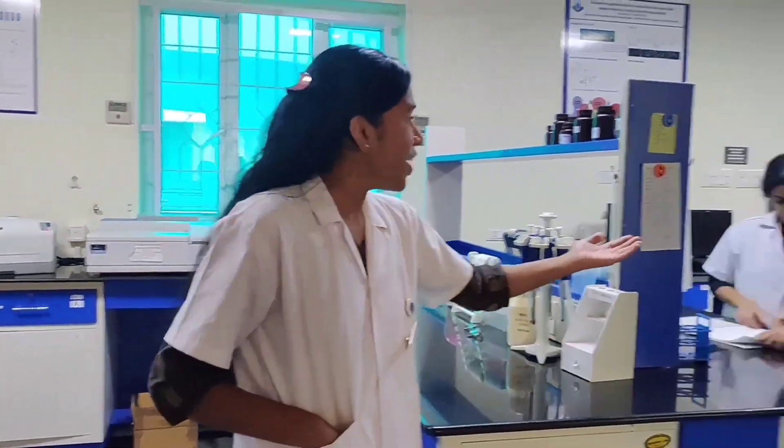Hi all, so today we'll be taking you through the protocol for the crystal violet assay. This experiment will be performed by our scholars Helma David and Anushree Sajeevan.